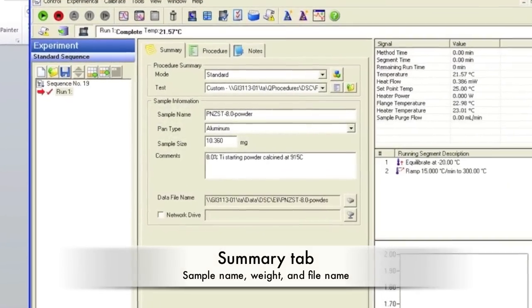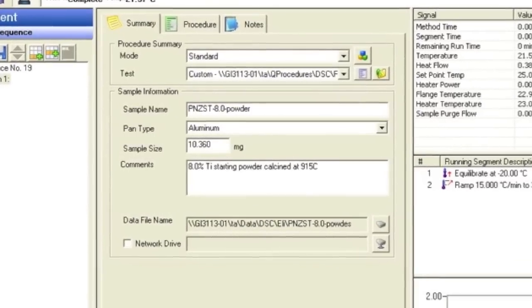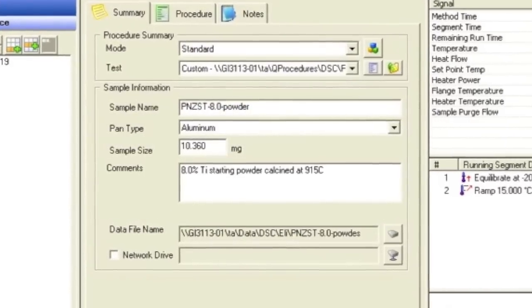In the Summary tab, make sure the mode is set on Standard and the test is set as Custom. The pan should be aluminum. Then specify the sample name, weight, and choose the file name and location.